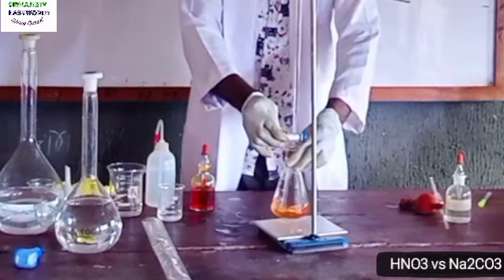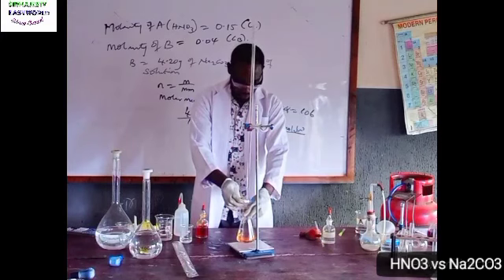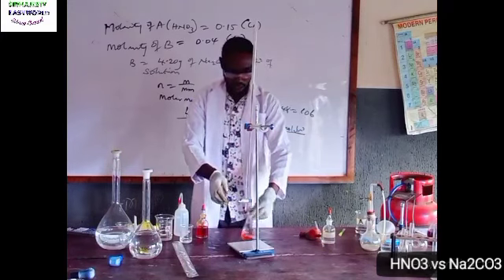Avoid adding excess acid. See, just a drop will take us there. Be very careful. Yeah. See, I've gotten it.